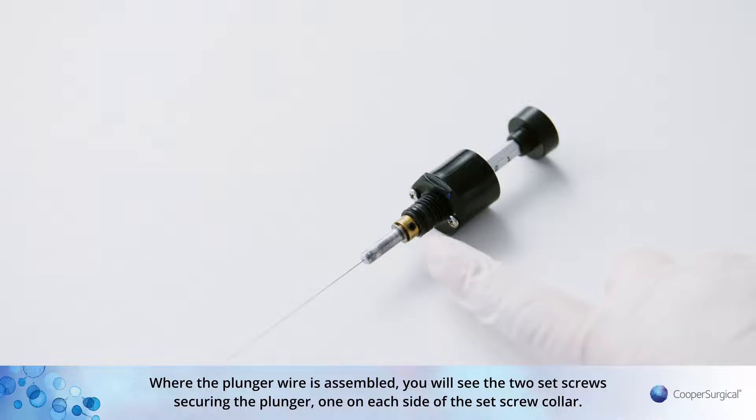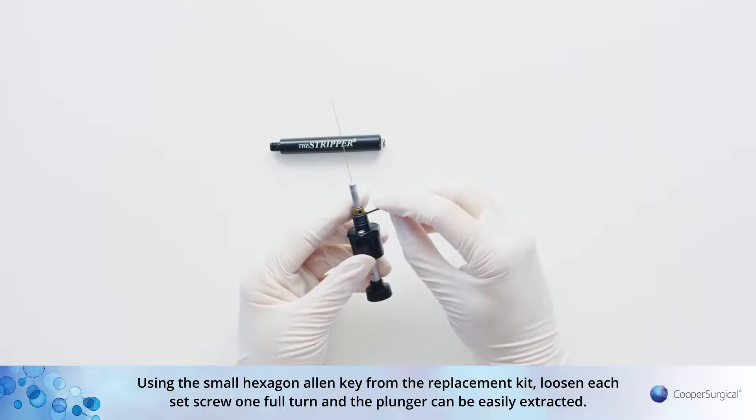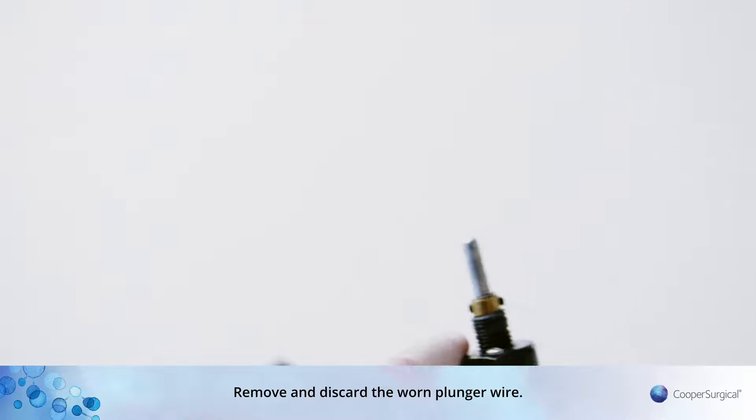Where the plunger wire is assembled, you will see the two set screws securing the plunger, one on each side of the set screw collar. Using the small hexagon allen key from the replacement kit, loosen each set screw one full turn and the plunger can be easily extracted. Remove and discard the worn plunger wire.